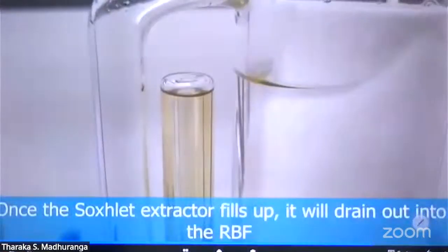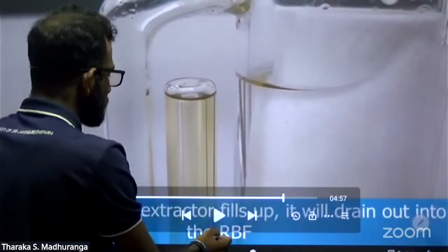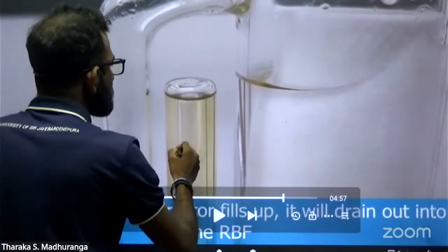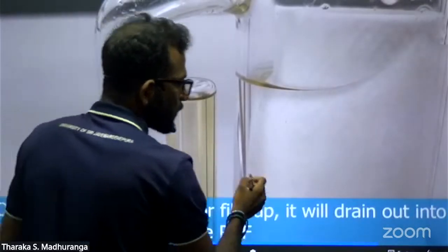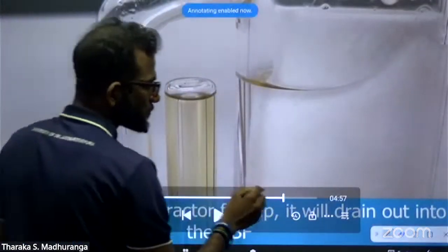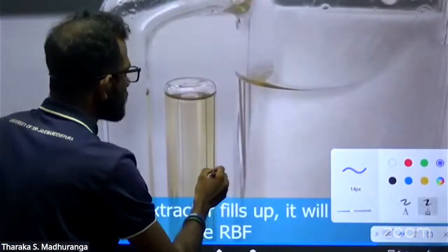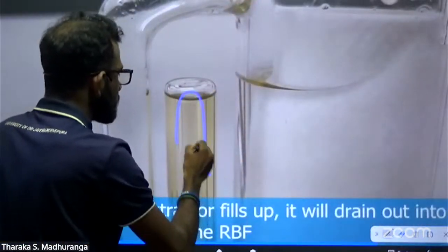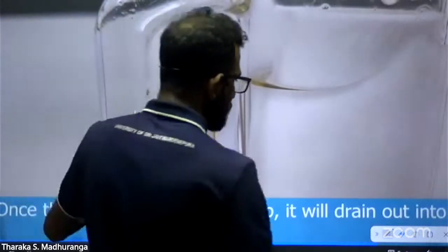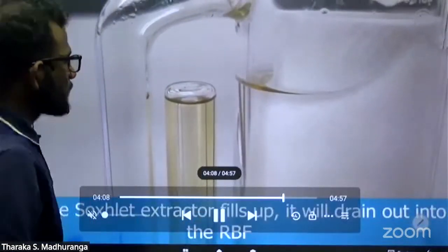That's a siphon tube. You can see that's a U shape. That's a siphon tube. We'll see what happens with the siphon tube.